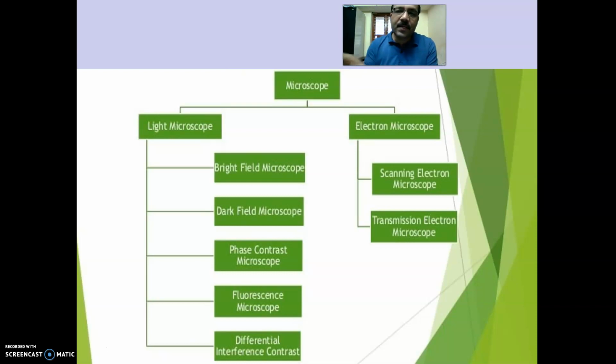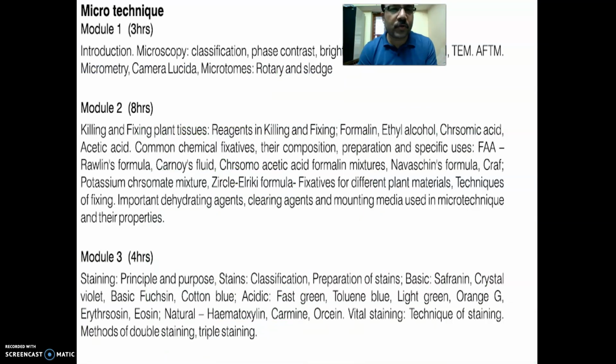Regarding the syllabus and the examination point of view, we are focusing on this particular microscope based on the previous question papers and also based on the different concepts of microscope. In the syllabus, we can see the microscope that we are going to discuss, that is phase contrast microscope. All the microscopes we have just mentioned about the concept.